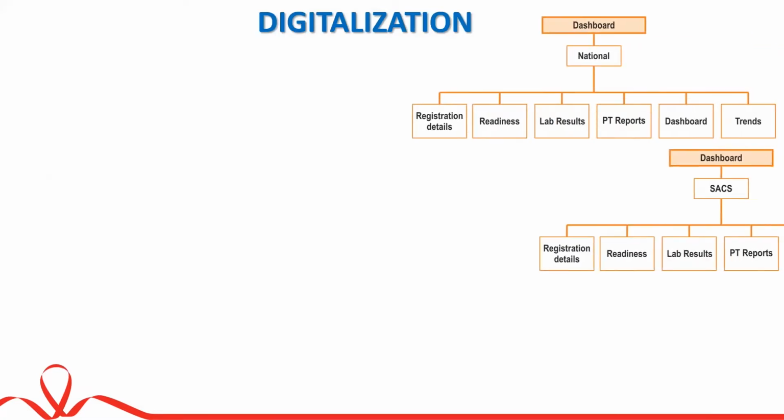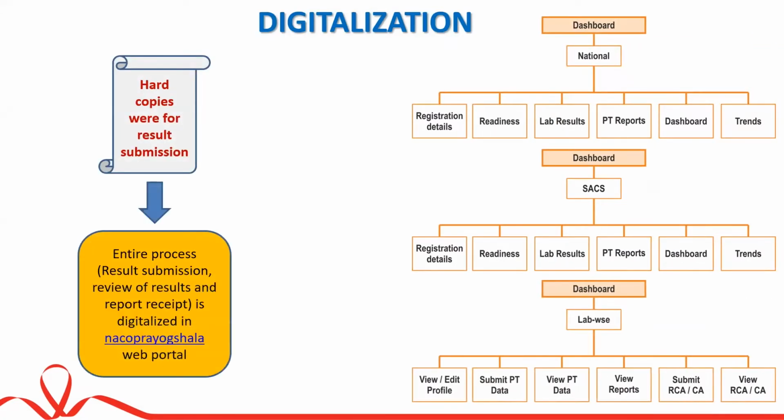So now, as we have discussed, till now hard copies were used for the result submission and the reporting also. This entire process was very cumbersome and time consuming. So using the NACO-Prayogshala, this whole process of external quality assessment is digitalized.